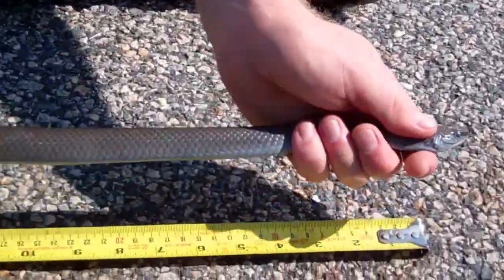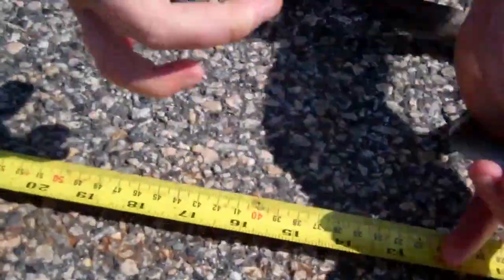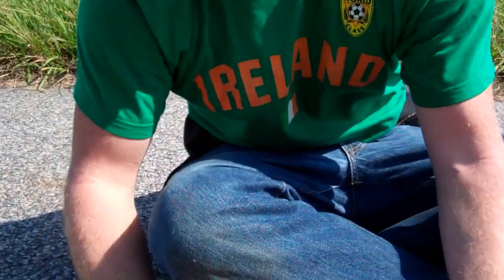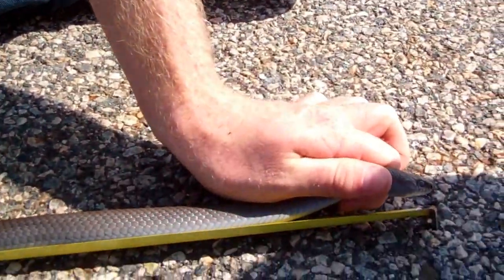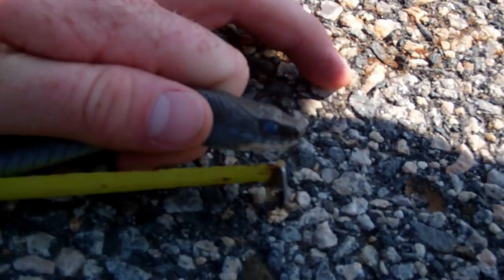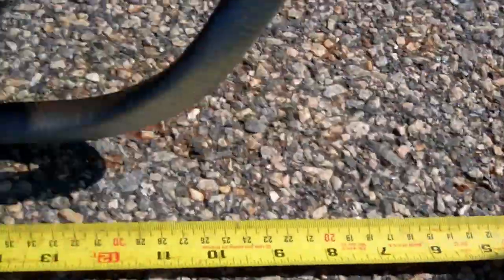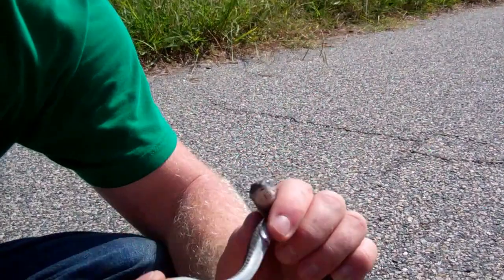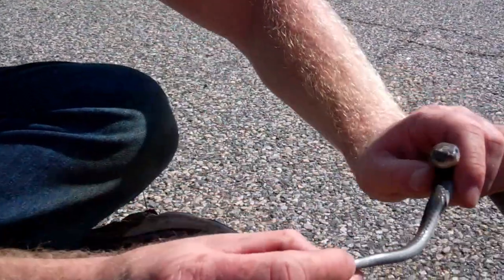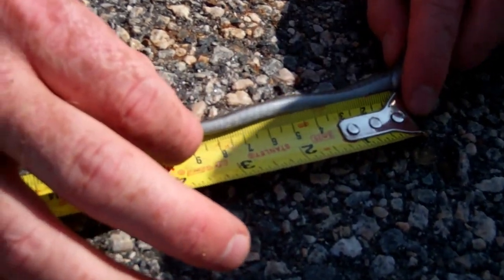We measure from the tip of the head down to his cloaca in centimeters if he cooperates. You see the blue eye? That means it's about to shed soon. So it's 70 centimeters — 70 for the SVL. And now we measure from the cloaca to the tip of its tail. This one has a bobtail — it's got eaten off by a predator. Ten and a half for that.